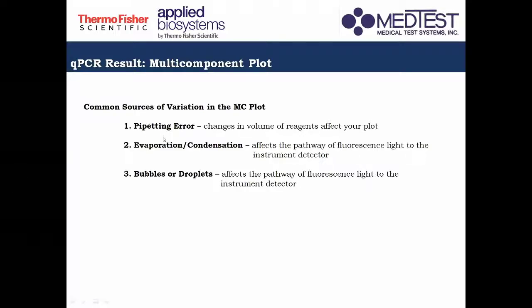So, ibig sabihin, yung mga volume ng reagents na necessary for a PCR run ay konti or kulang, no? And this will affect your plot as well. So aside from pipetting errors, this is also important that your pipettors, the liquid dispensing instruments that you have, should be calibrated as well.